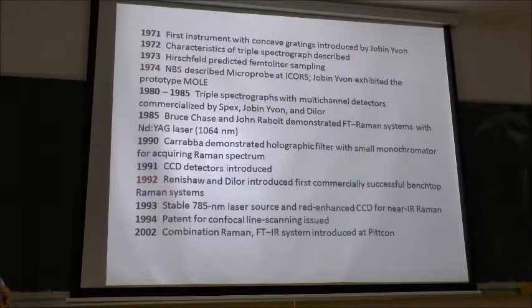From that year, the number of Raman instruments increased considerably. So nowadays it's a pretty usual instrument in the lab.